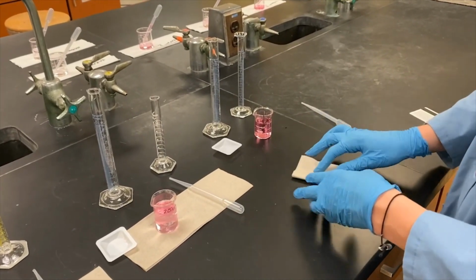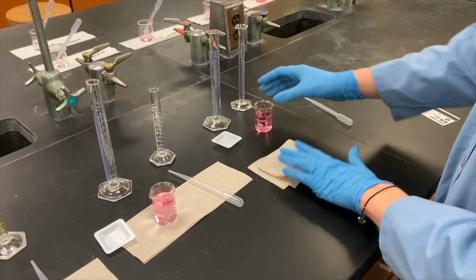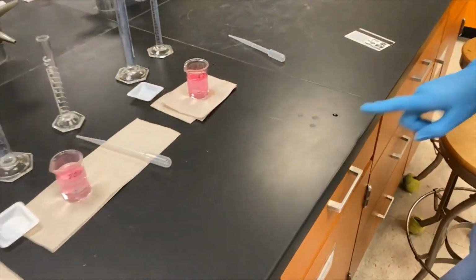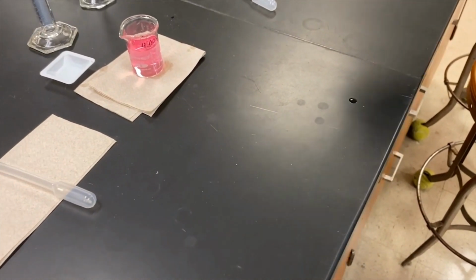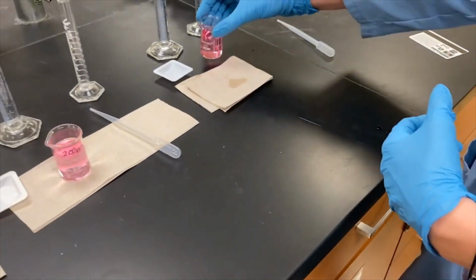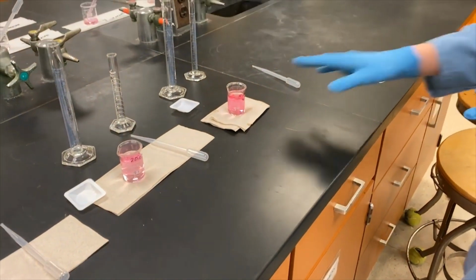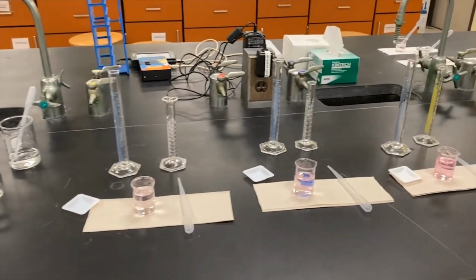The last thing you want to do is make sure that you are responsible for cleaning up all your spills, because if you see a puddle of some solution in the lab, if it's a clear colorless liquid like this one is, I don't know if that's water, I don't know if that's acid, so if I go to wipe it up with a paper towel, and especially if I don't have gloves on, I could get hurt. This is a little bit smaller, but you still want to make sure you're cleaning up your messes so that someone else doesn't have to be faced with the confusion of spilling something or cleaning up something unknown to them.